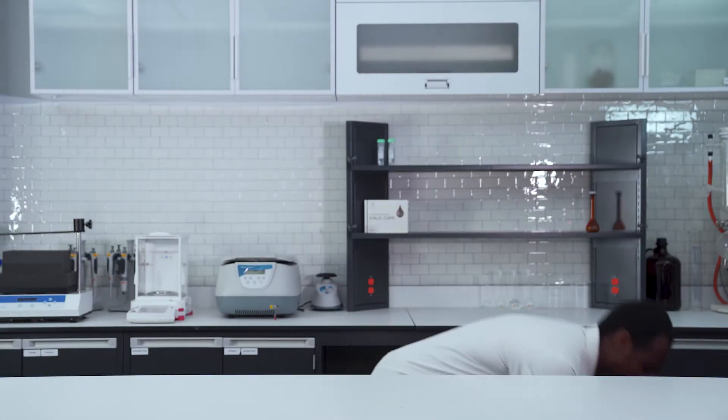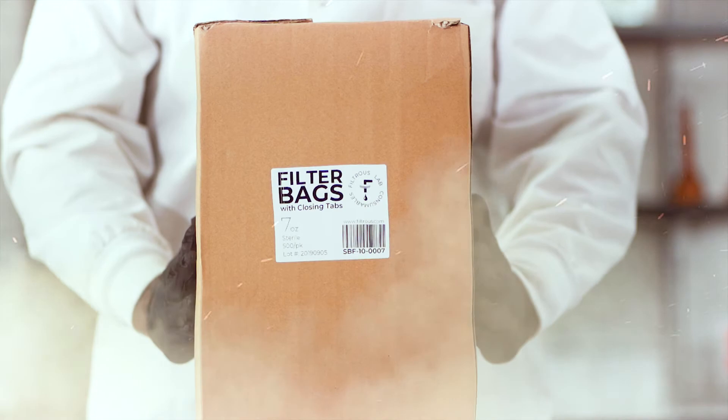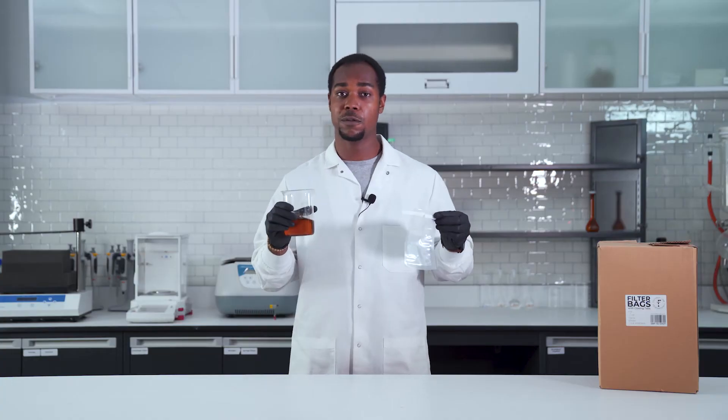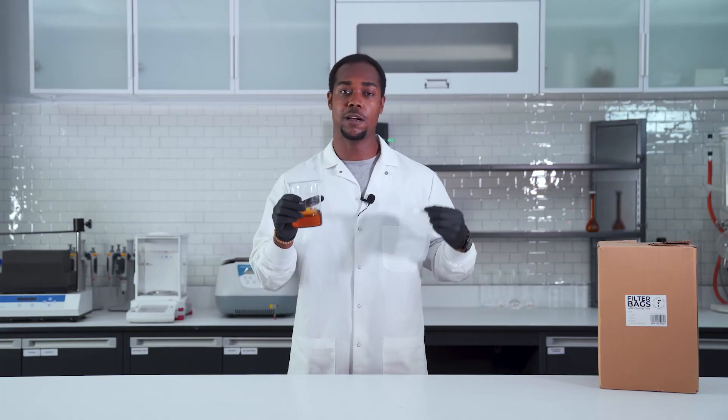Wait, there's more. Filter bag — she's similar to her big sister, the sampling bag, except this girl's just a little bit more special. She's able to separate large particulates from dirty solutions.